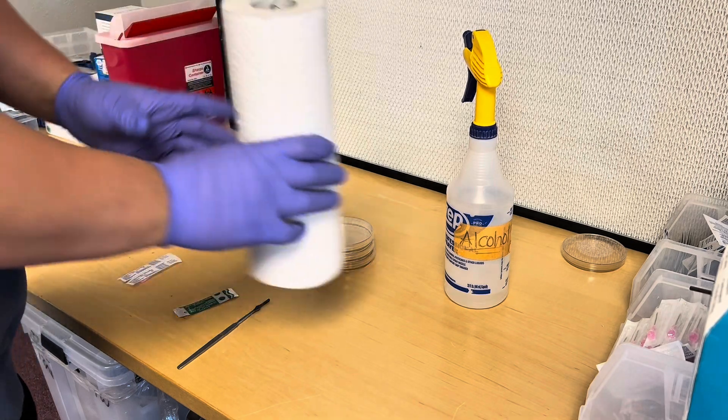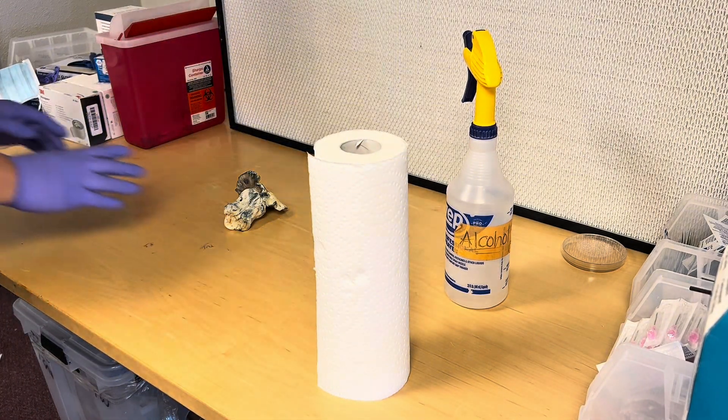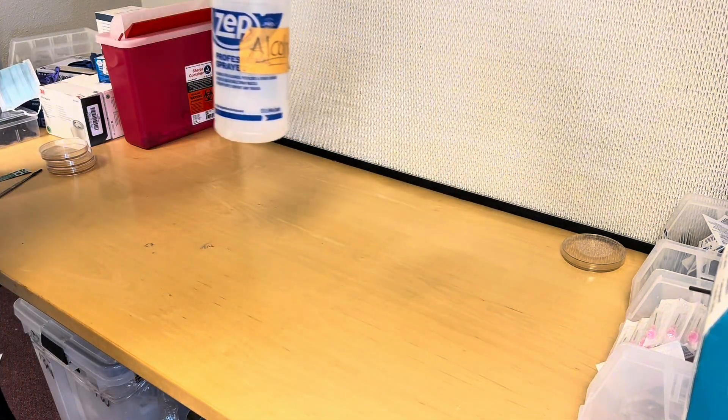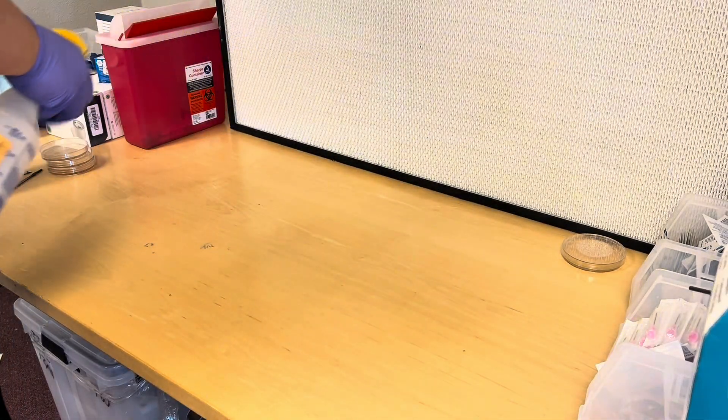I forgot to mention: you're also going to need paper towels to wipe down your space with 70% isopropyl alcohol before you start. Let's go ahead and get right into it — move everything to the side, spray the surface down with 70% isopropyl alcohol, and wipe it down.